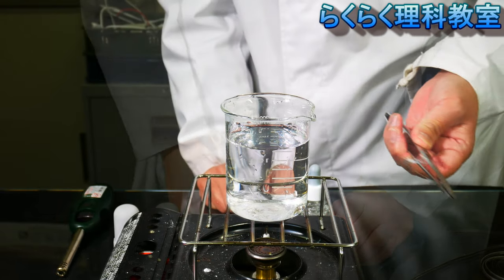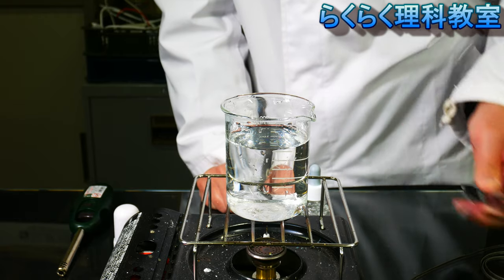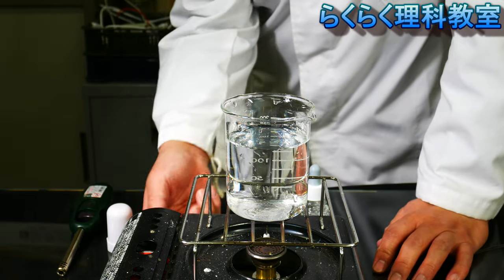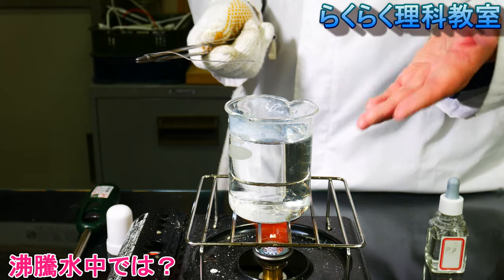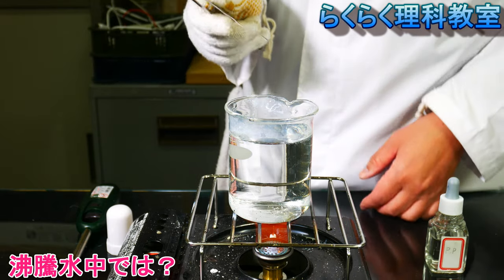When the magnesium ribbon was burning, the heat will be turned out. The heat will be heated, and the water will be heated.